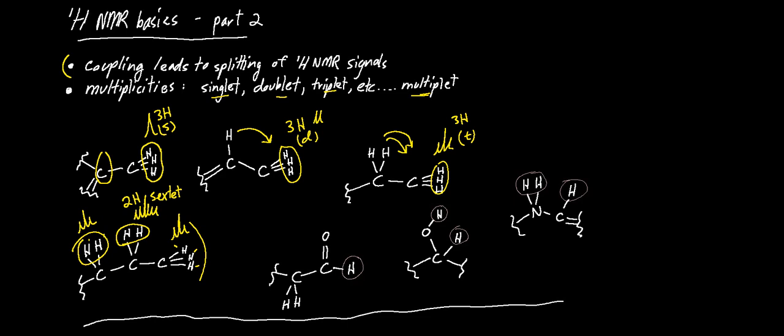Now there's a few exceptions. Aldehyde protons, like you see here, are often not split, almost never split, in fact. The carbonyl forms some sort of barrier to coupling, even though you think it ought to split. OH and NH protons are sometimes split, sometimes not. They're usually broadened, and so with these two, it's sort of a case-by-case thing. Sometimes they are split, sometimes not. Often, I would say, not split.